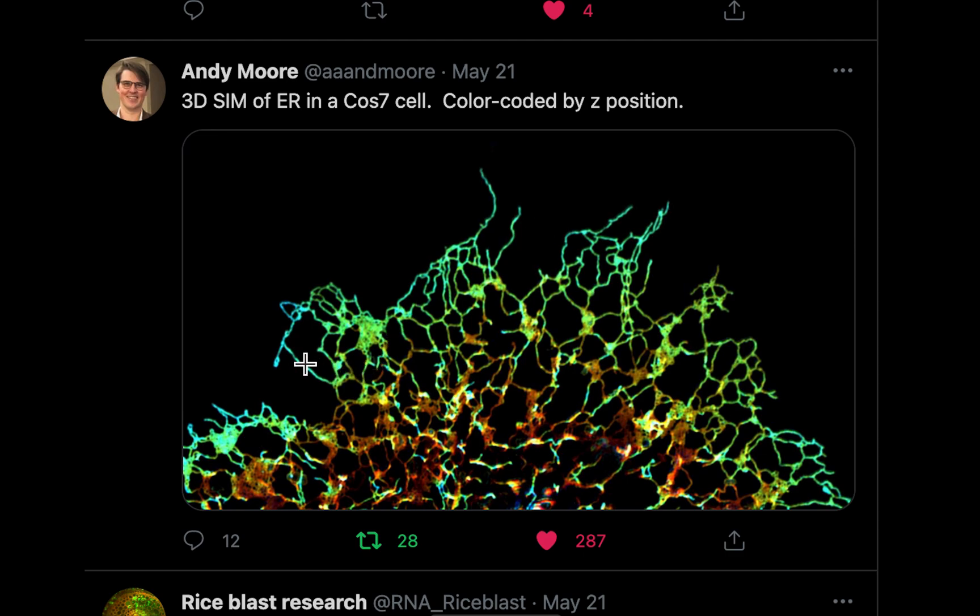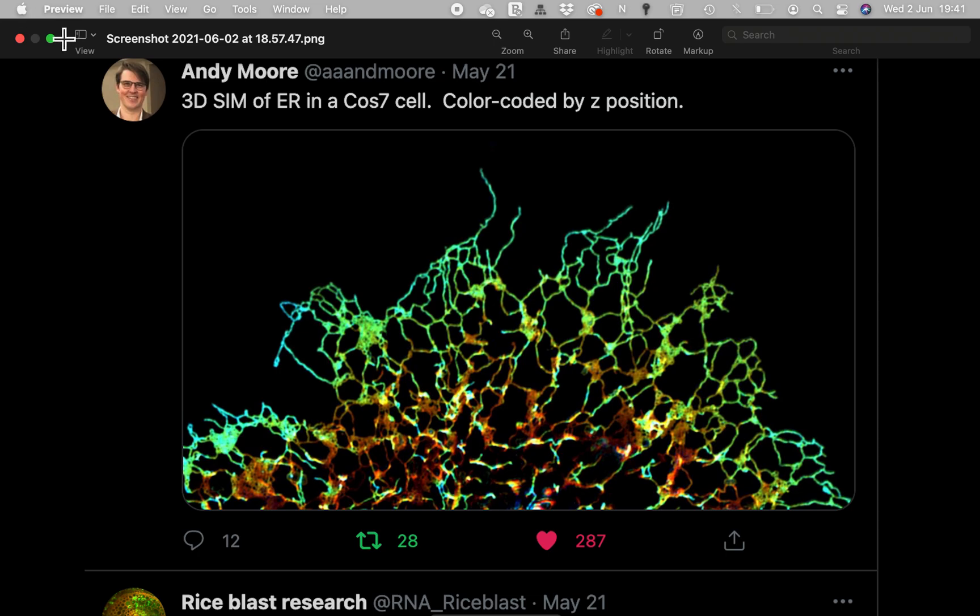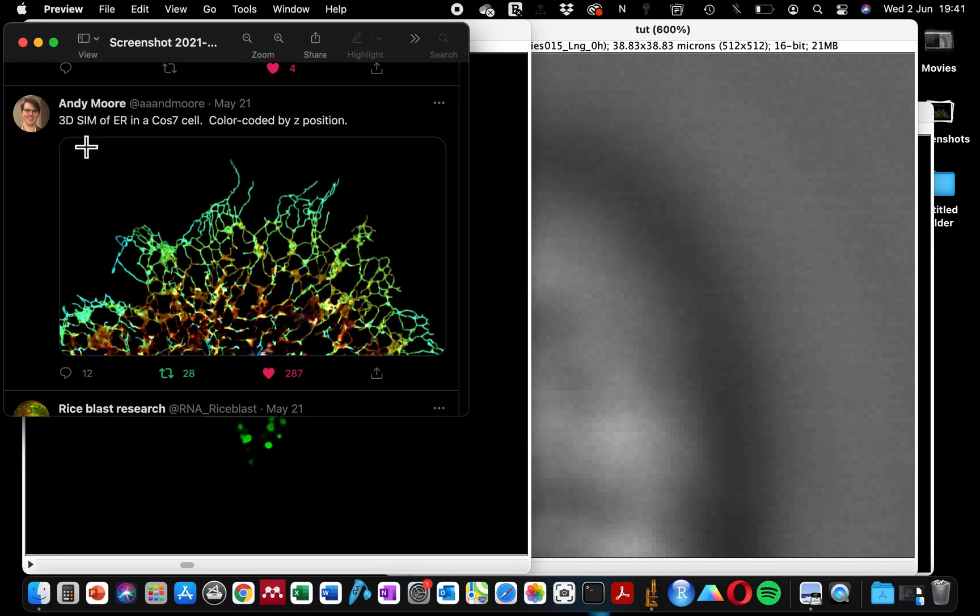The different colors indicate the different positions that these image structures were within the Z-stack images. When I saw this tweet, I immediately put this down in my to-do list that my next ImageJ tutorial would be how to color code Z-stack images.